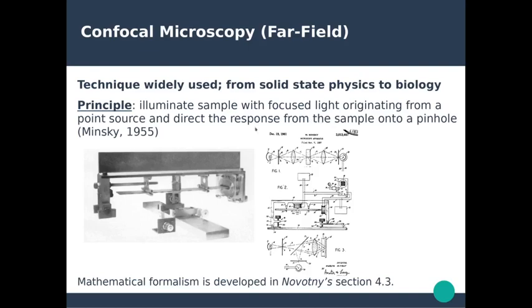And the principle that has been introduced by Marvin Minsky is just relying on the fact that if you illuminate a sample with a focused light, which originates from a point source, and you direct the response from the sample to this excitation onto a pinhole, then you can achieve a resolution that goes beyond the diffraction limit. So this is a picture of the first prototype that Minsky developed in 1955, and this is the first page of the patent that he filed in 1957, showing all the optical setup.